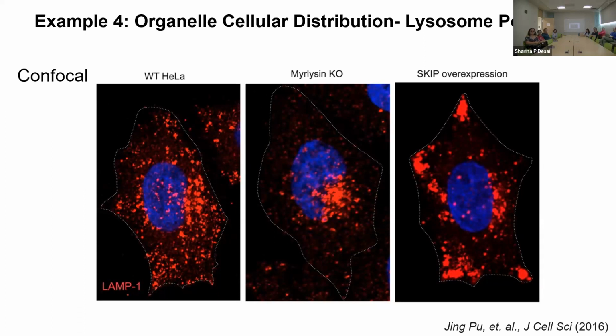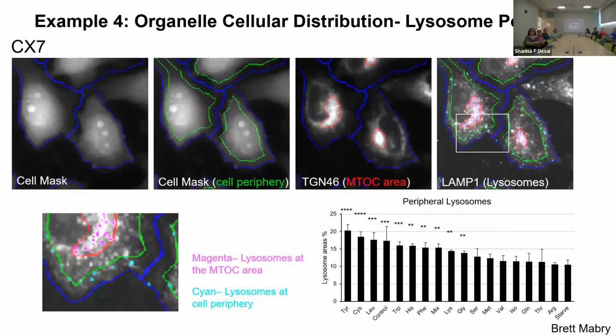So why lysosomes do that and what the function actually is, we really don't know. That's why we're really interested in that. So first, if we want to study that, we need to have a method to quantitatively analyze the lysosome position. Here, I show you a method that we use.